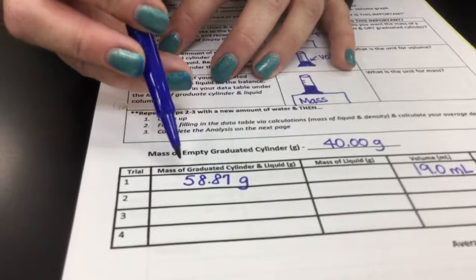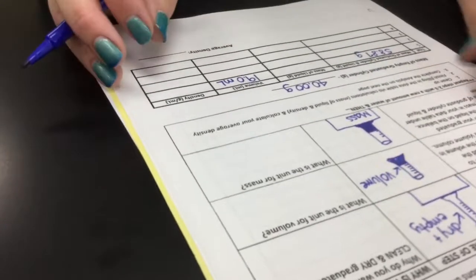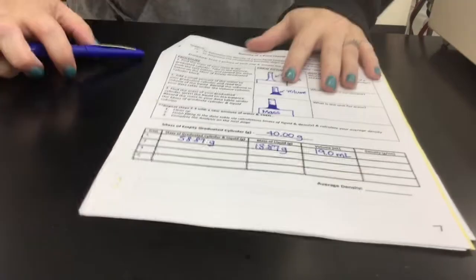Okay, so how I find the mass of the liquid is I subtract the mass of my empty graduated cylinder from the mass of my graduated cylinder with water. All right, so my water is? So it's 58.87 minus 40, so that would be 18.87. If you couldn't do that in your head, you know, use a calculator. All right. Very nice. In the last column, we can do that at the very end.